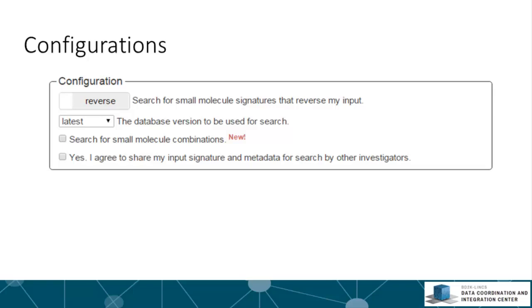Small molecule combination search is supported, but you have to check the search for small molecule combination checkbox. Users can also share their input signatures and metadata so others can query the signatures and gene sets they submitted by checking the share checkbox.